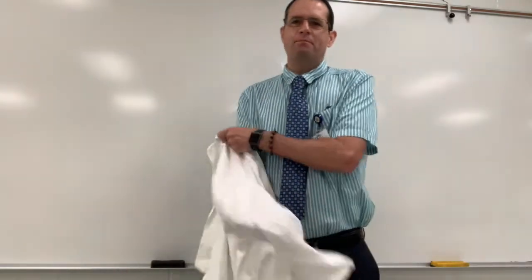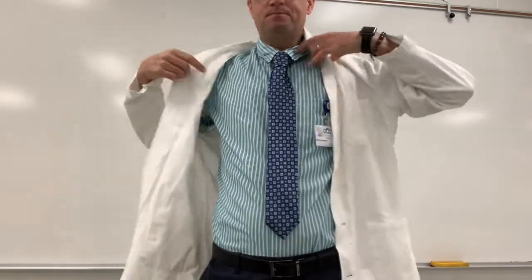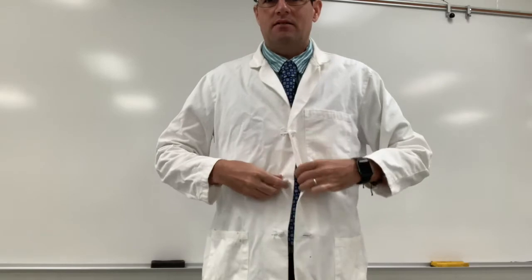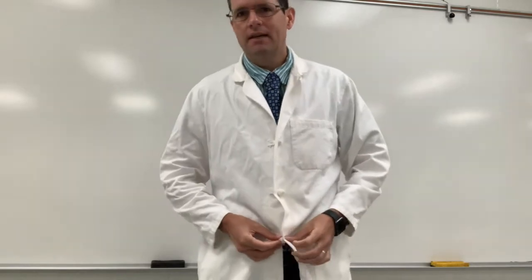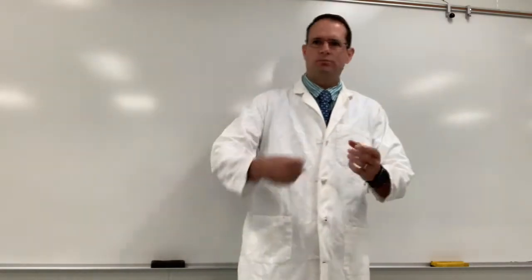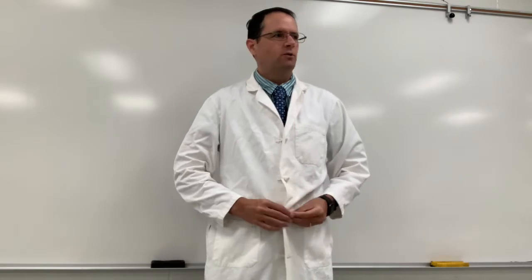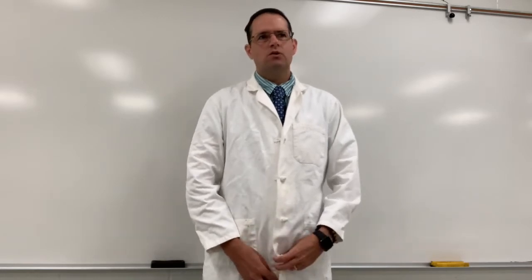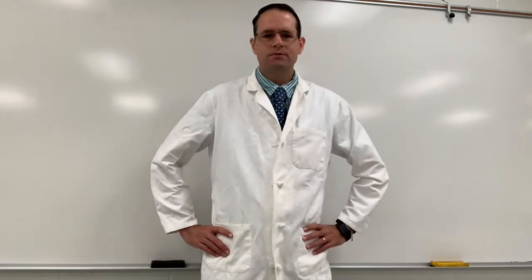In this first video, what I'm going to do is read to you the pre-lab, and on the board here, maybe draw the structure of acetanilide and perhaps discuss a little bit about the physical properties of acetanilide that allow it to be recrystallized from water. And then I'll do the lab in kind of silent mode. I will just mix things and pour and weigh, and there will be a time acceleration for waiting for things to cool down and things like that. So it'll be already fast forwarded on the video. And I'll note how many minutes it takes for that. So that's the lab.